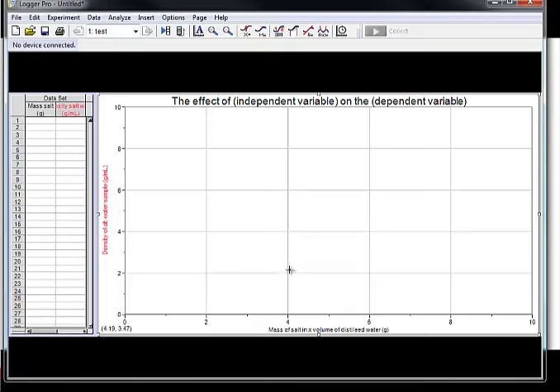Now then, you're going to go back in the lab, and using the procedures you and your group have designed, you're going to figure out how concentration of salt in a sample of water is going to affect the density of that sample of water. Okay? Now, you may get back in the lab and realize, the procedures we've designed, these aren't really working. I need to make some modifications. That's fine, as long as you write it down in your lab logbook.